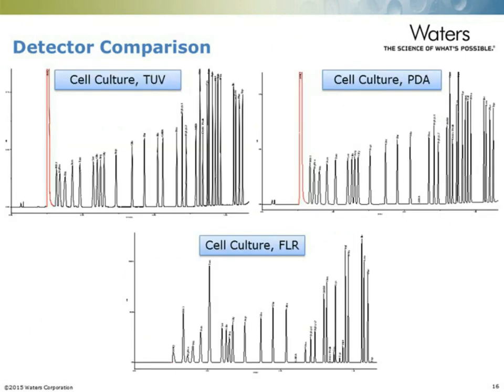The kits used for the instrument can be used with any of the common detectors. We most often use the method with a tunable UV detector because all the amino acids have the same derivatization group.